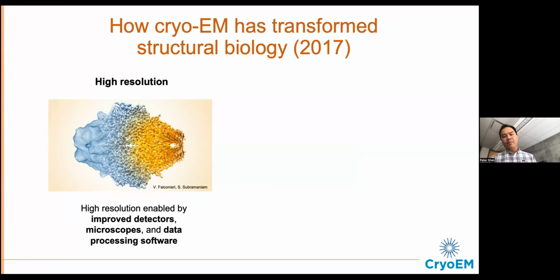This is a rather atypical talk for me to give. Usually, for more cryo-EM centric talks, I spend my efforts in talking about how great the method is. And the method truly is wonderful. But of course, most of my time today will be spent on sharing some of the hurdles that we've faced. Now, this audience really needs no introduction to the potential of cryo-EM.